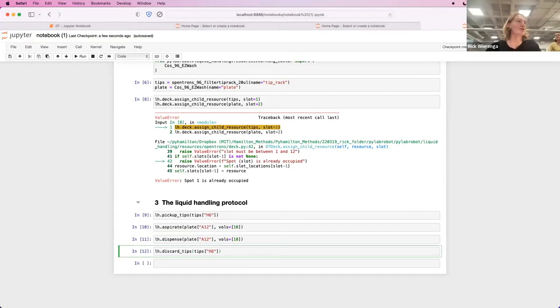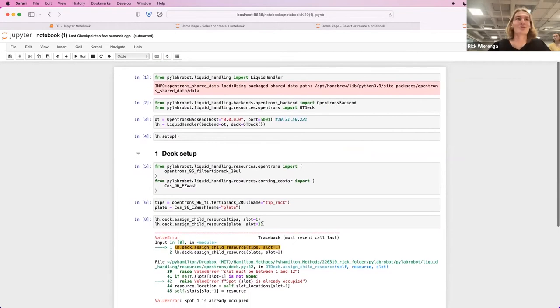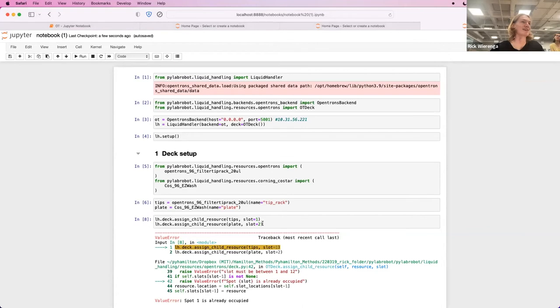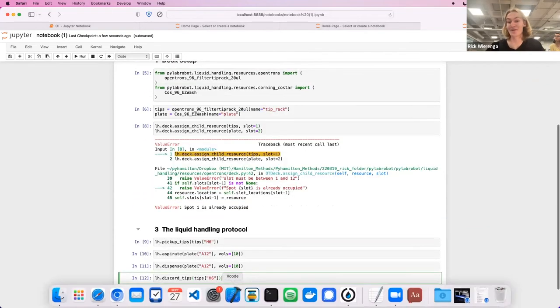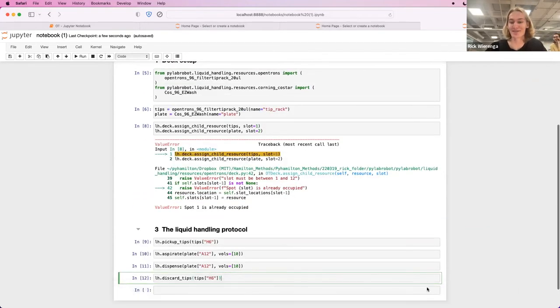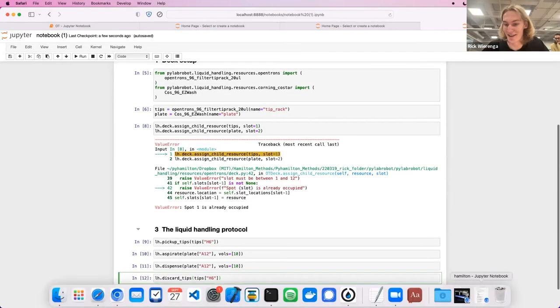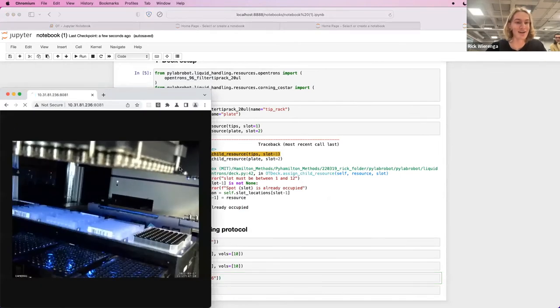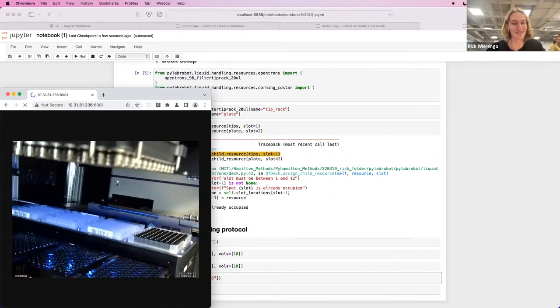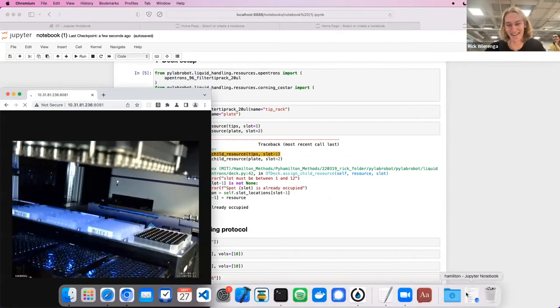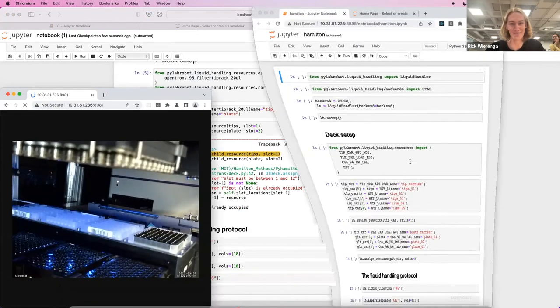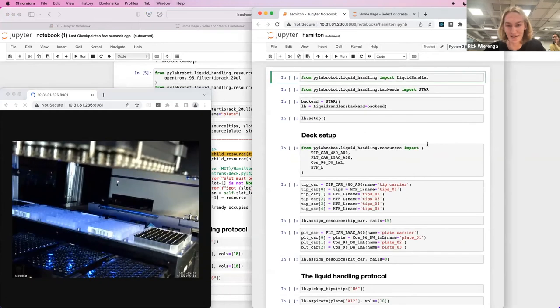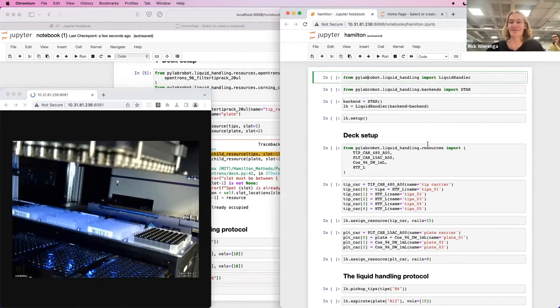So now we ran something on the OpenTrons. But as many of you know, we also have Hamiltons in the other building, which we can also control. I have a live video feed here of the Hamiltons. I'm FaceTiming with the Hamiltons.